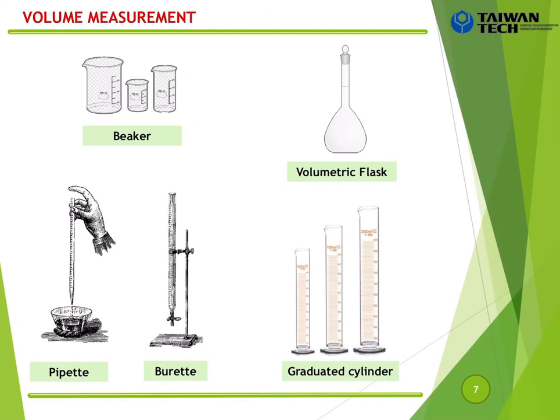and the next one we consider is the volume measurement. Volume measurement means that we want to know about the volume of our solution. Usually in chemistry, we will consider the volume of our solution, okay? So we want to know the volume. So volume may be in milliliter or maybe in liter, okay? It depends on the experiment you want to use, but usually we will use milliliter, okay? Not much for the solution.